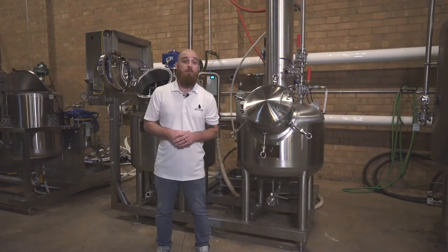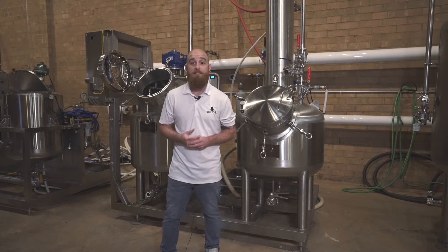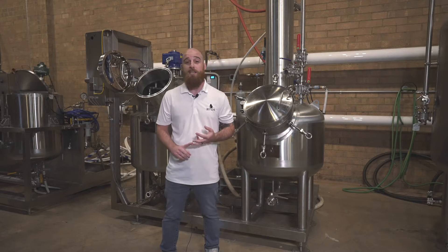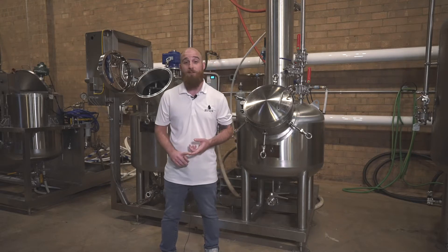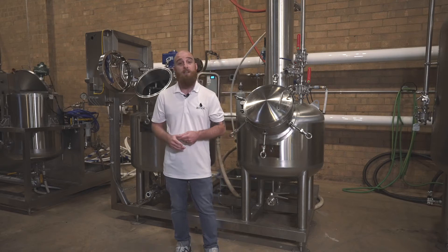Over the last few weeks and episodes, we've taken you through a couple of our different processes and equipment that we specialize in, ranging from extraction, winterization, post-processing, and even a little evaporation and distillation. So continuing with that downstream process trend, what we're going to introduce today is the Deutsche Roto EVAP.